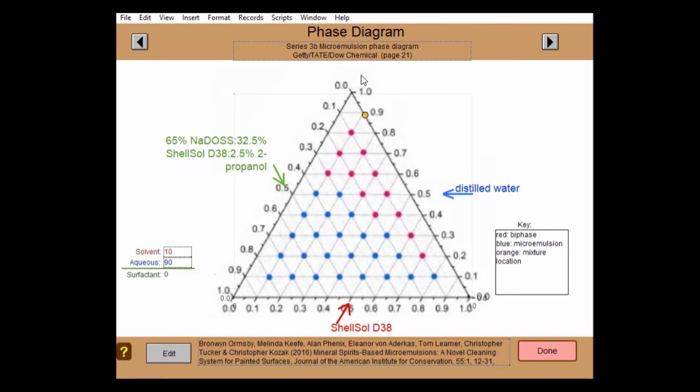So in this one, if I look, the least amount of surfactant I can use coming down here would be this system in blue. And blue dots are going to represent actual microemulsion systems that have been tested and will actually form a microemulsion. So this particular system, if I want to use as little surfactant as possible, I would come here. And this would be like 6.5 weight percent out of 100 milliliters for the surfactant in this particular surfactant system.